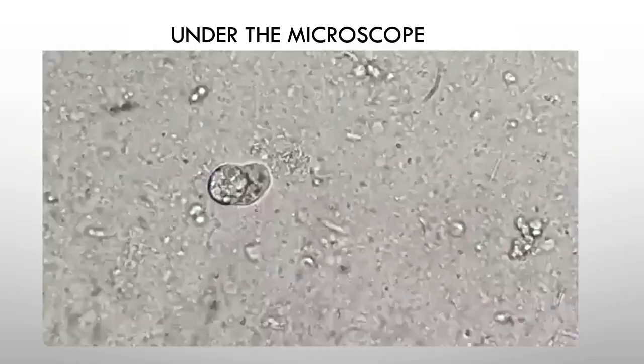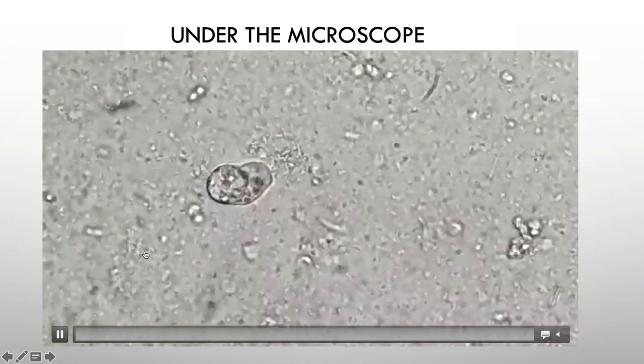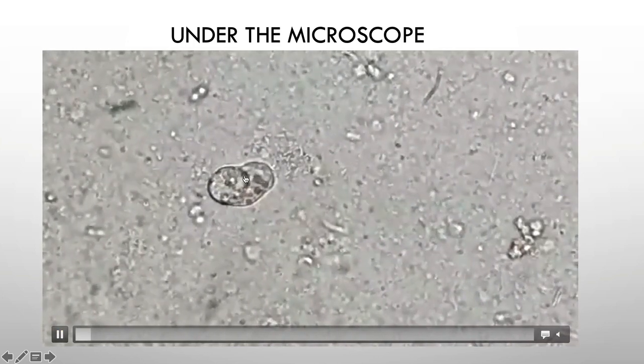Let's see how we can see the parasites actually under the microscope. Here's the microscope, okay, and this is the stool sample, and you can see the movement of this parasite.